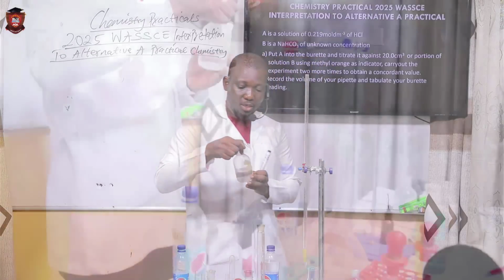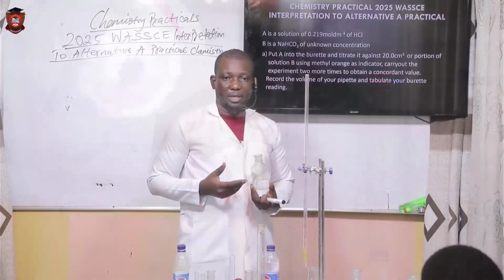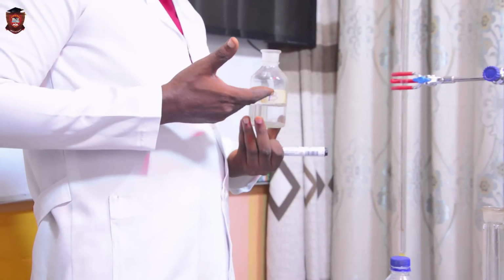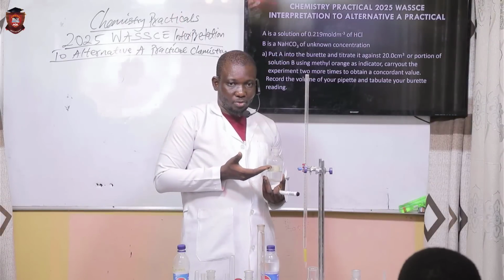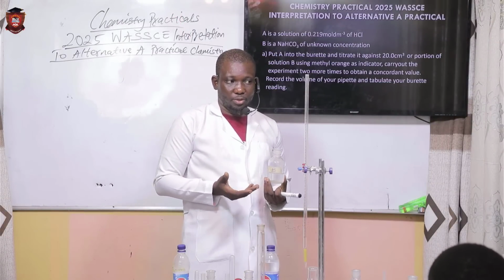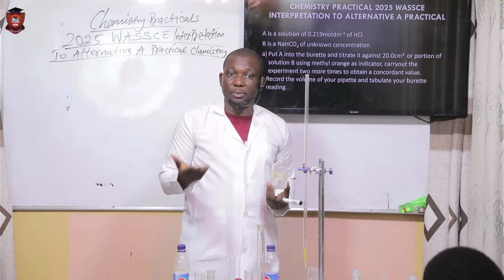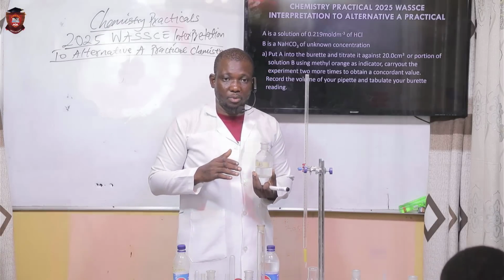The B in advanced learning, B is called the analyte, something that is being analyzed, or something that you are going to use to analyze something that is here. So the analyte is used to determine some kind of concentration. The concentration of what is here is most often known. The concentration of what is in B is most often not known.